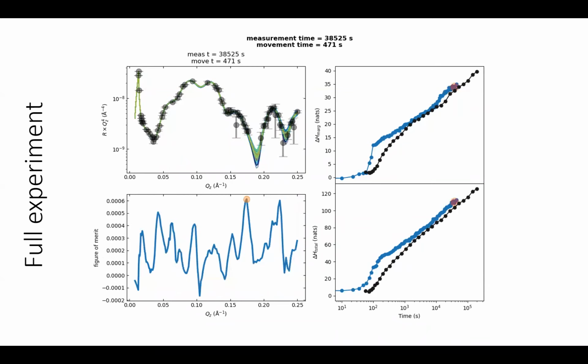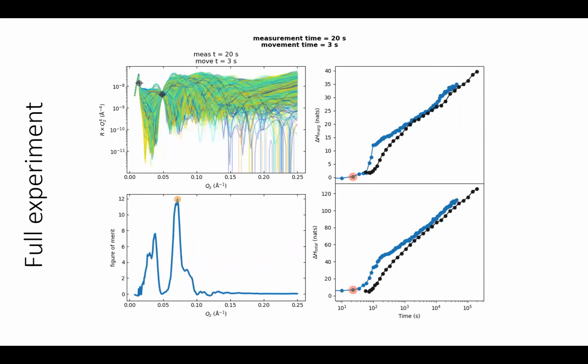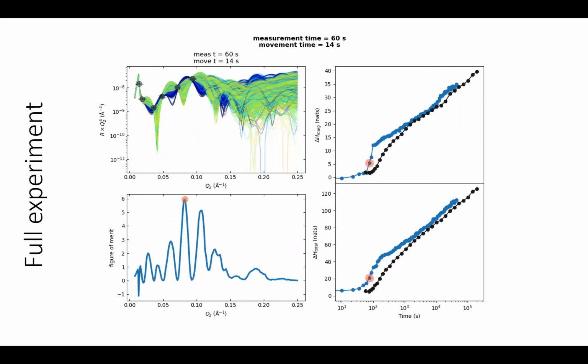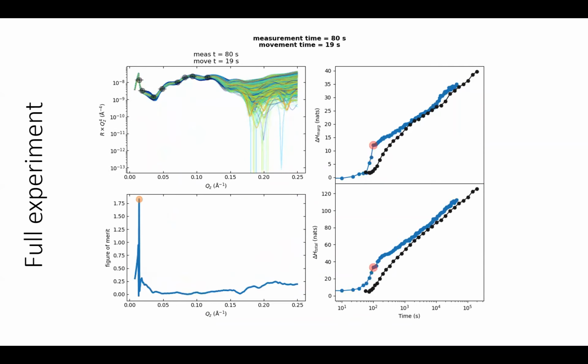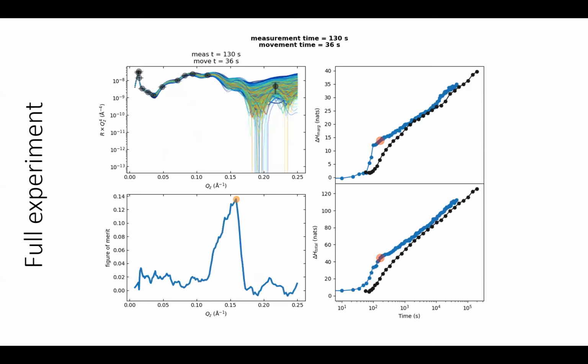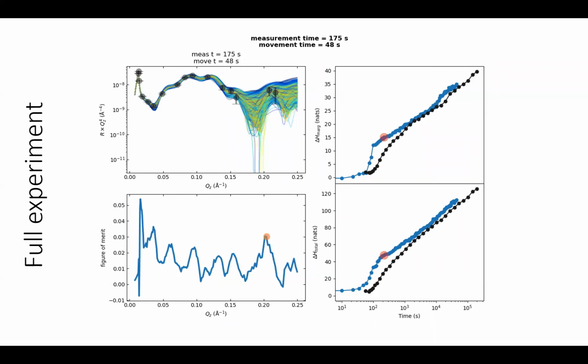I have a question and a comment. I think this is beautiful because what you're doing is basically concentrating on the measurements as you go. I guess you're doing fitting while measuring, if I understand you correctly. Yeah, that's correct. Then, one of the problems that we usually have is that some of the parameters are correlated.